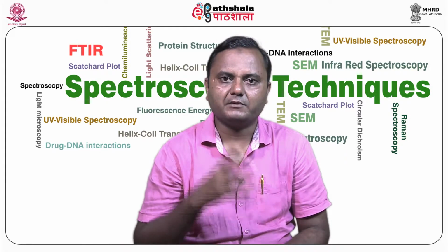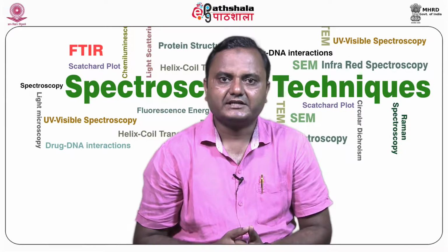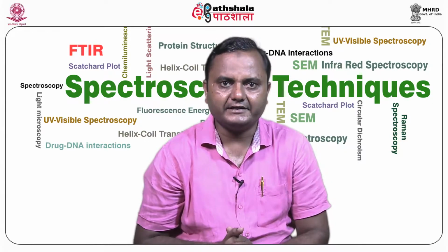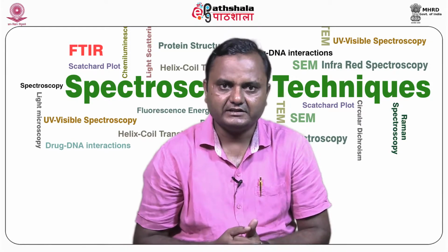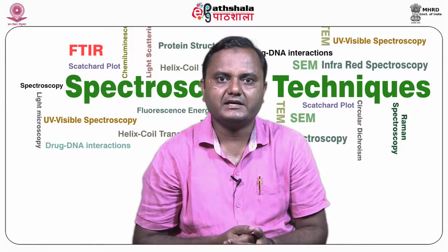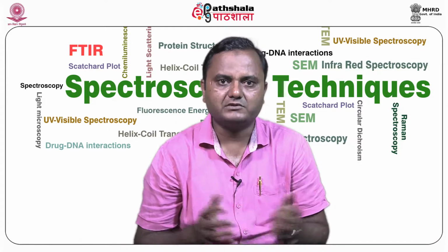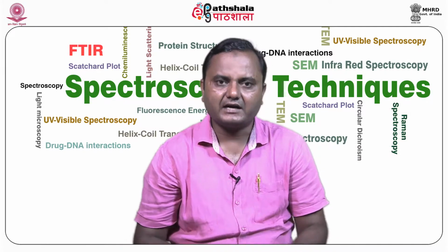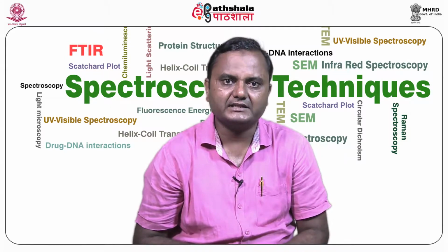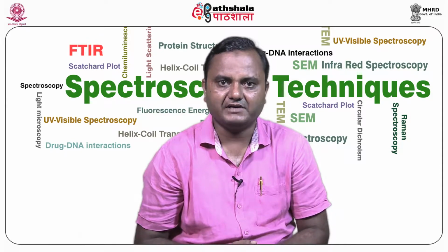So, first we will talk about the right angle light scattering detector. It measures only at 90 degrees and has the best signal to noise ratio and sensitivity. It has the smallest flow cell and can only measure the molecular weight accurately for molecules with an Rg value less than 15 nanometers. These are excellent for measuring protein molecular weight but cannot measure the Rg value.